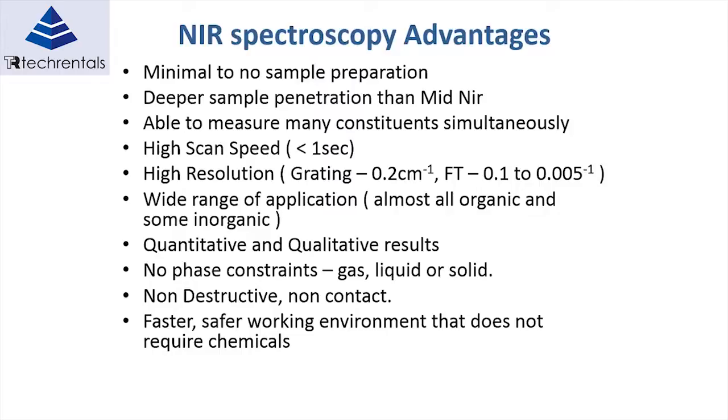There are no phase constraints. It'll work in a gas, a liquid or a solid. Depending on the absorption of the material, you'll be working either in reflectance mode, say for powders, or in transmission mode for liquids. It's non-destructive. There's no contact required with the material.